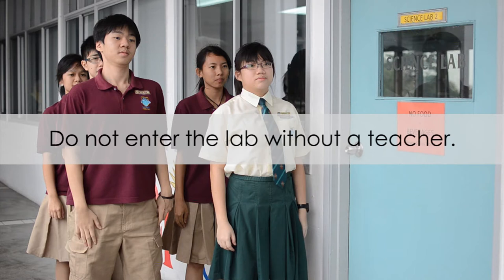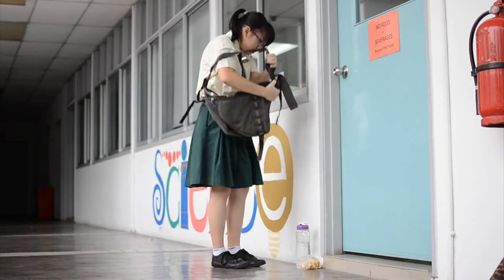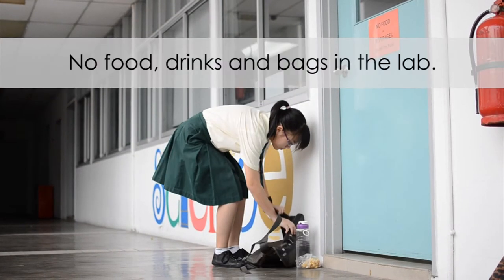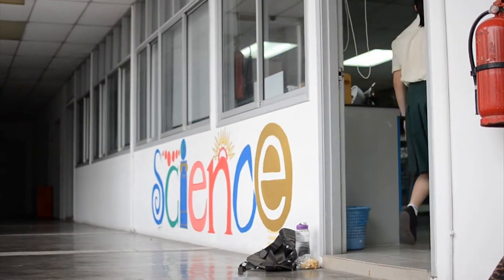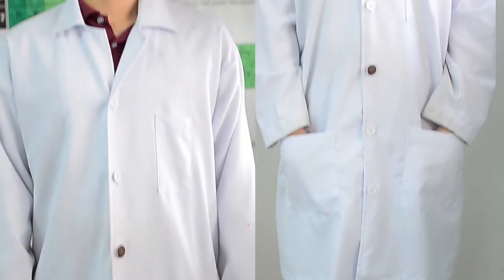Even in a zombie apocalypse, ensure that you have a teacher present before entering the lab. Remember to leave all food, drinks and bags outside the lab. Before entering the lab, ensure that you have put on the necessary protective clothing — that includes your lab coat and your goggles. This helps to protect you from chemical spills and splashes. Long hair should also be tied up neatly.